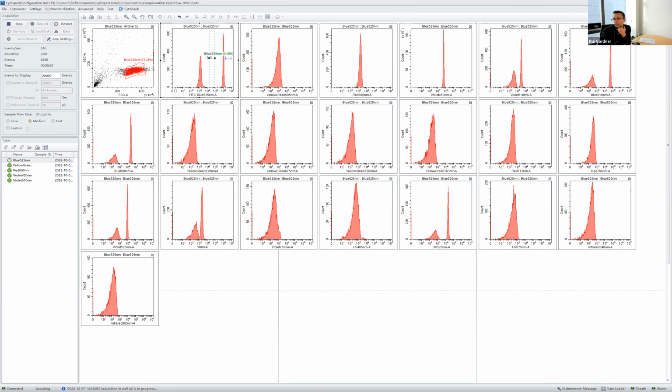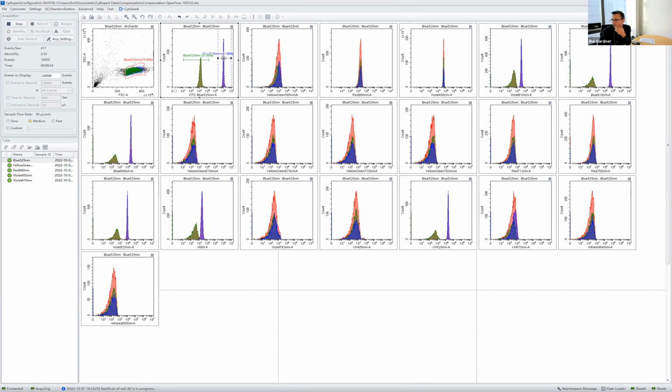The other question is from Kiara, which is related to the CytoFLEX. She'd been told that the CytoFLEX is more permissive and copes very well with bubbles, even if you take the full volume of the well. Is this true? If you're going to be running air for about 5 minutes or so and something's left in run, that's why I was a little cautious and said to make sure you carry out a couple of primes and be mindful that you hit record.